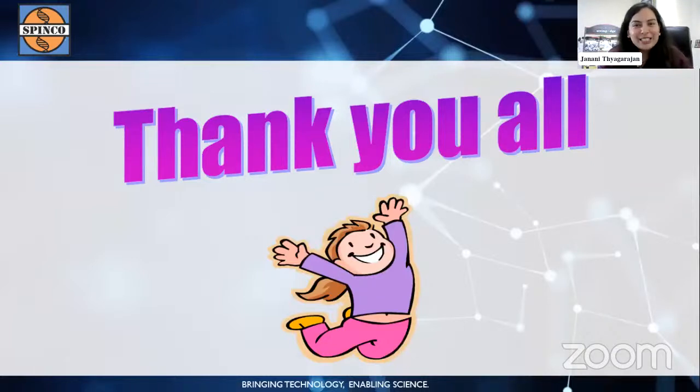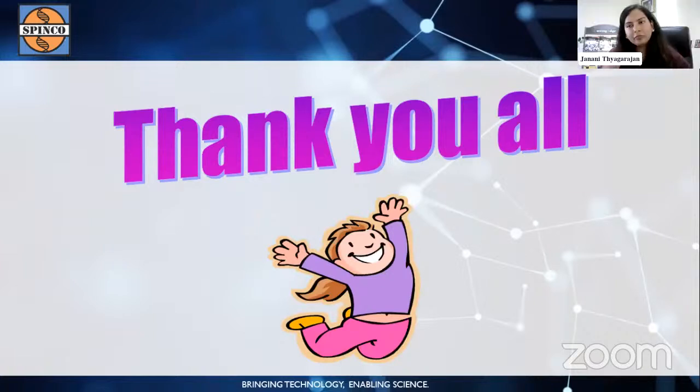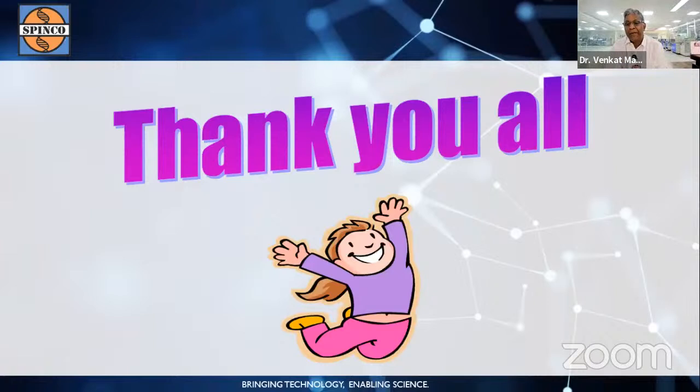Can you explain the jet separator in 2 minutes only? So he just wants more information on the jet separator. The jet separator is used for packed column gas chromatography, where the flow rate is 30 ml per minute, number one. Number two, the temperature of the jet separator should be kept around 250 degrees centigrade. Therefore, you have to use a special glass jet separator. And there are methods of connecting the jet separator to your packed columns. There are different methods available, and you should connect accordingly.